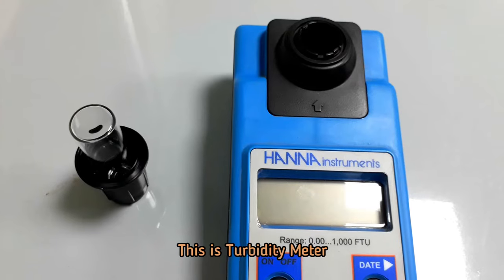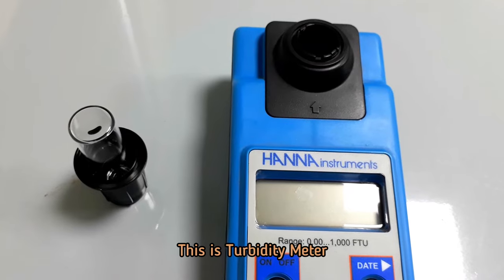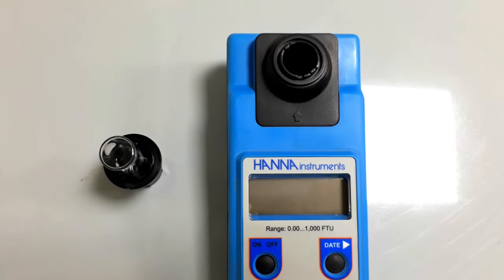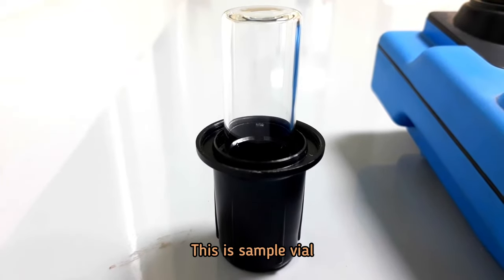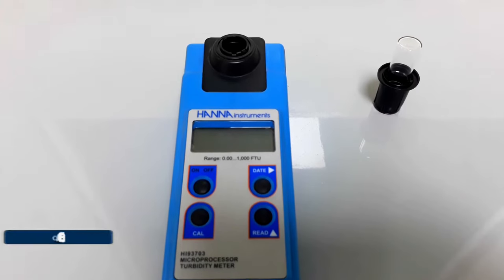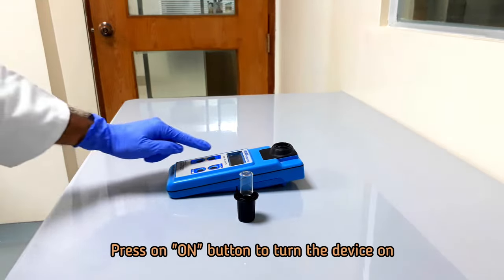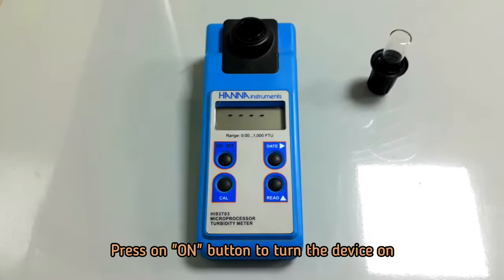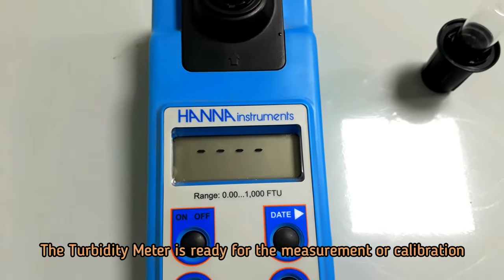This is turbidity meter. This is sample vial. Press on button to turn the device on. The turbidity meter is ready for the measurement or calibration.